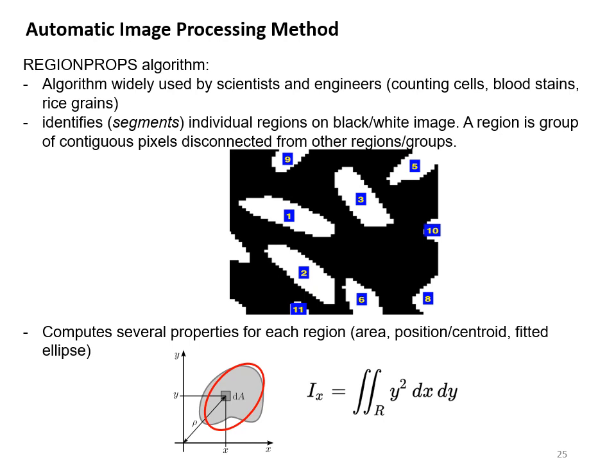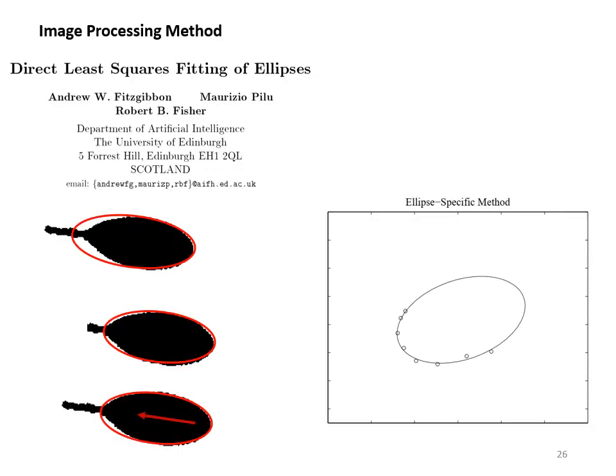So what I found, and it's also well known in the community, is that if you have tails, the second moment fitting of region props tends to make ellipses that are a bit too long. So I also implemented in the code another way to fit ellipses by the least square method of this group, where basically you extract the points of the boundary of your segmented area, and then you try to fit an ellipse to this boundary.